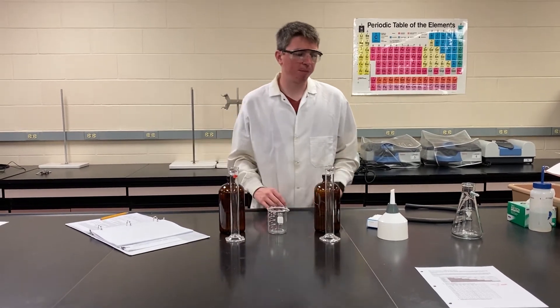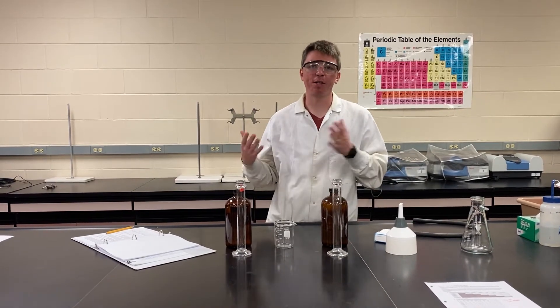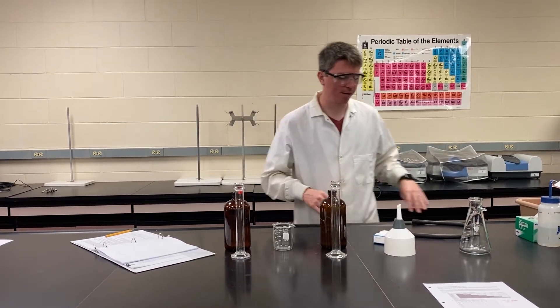Today we're doing an experiment based on the concept of stoichiometry, but it also builds on the precipitation reaction experiment we did.